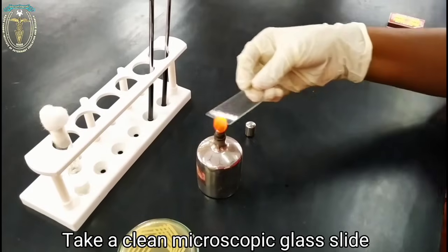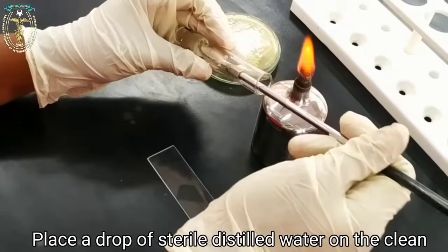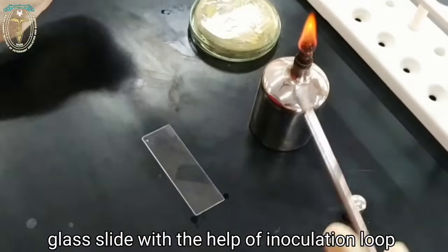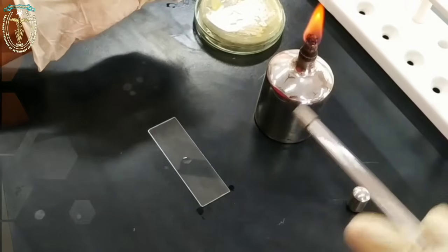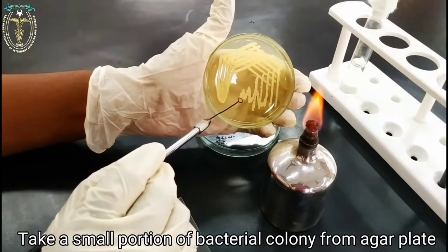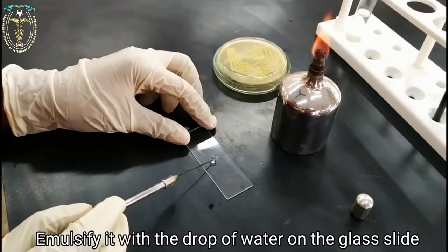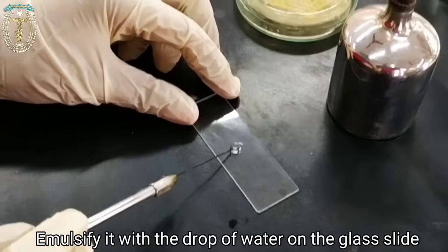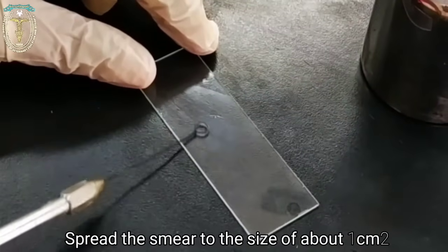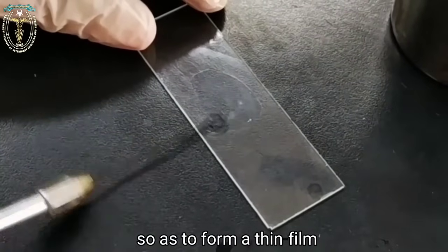Take a clean microscopic glass slide. Place a drop of sterile distilled water on the clean glass slide with the help of the inoculation loop. Take a small portion of the bacterial colony from the bacterial culture plate and emulsify it with the drop of water on the glass slide. After emulsifying, spread the smear to the size of about 1 centimeter square, so as to form a thin film.